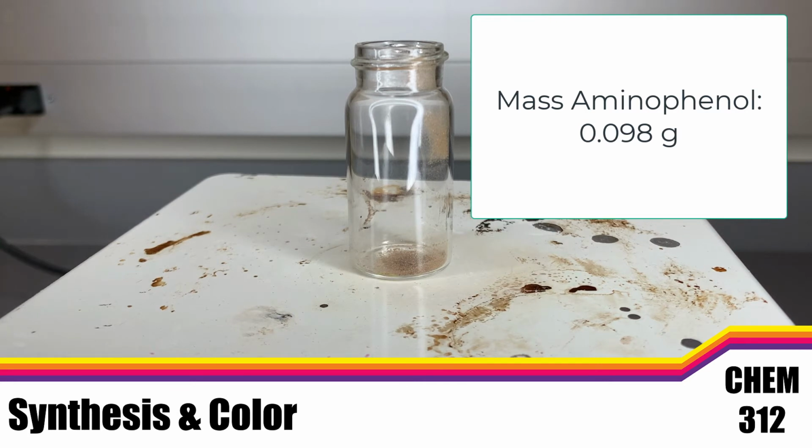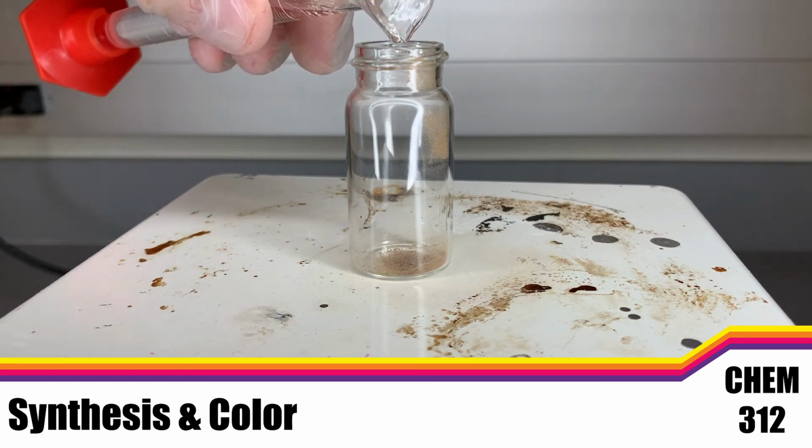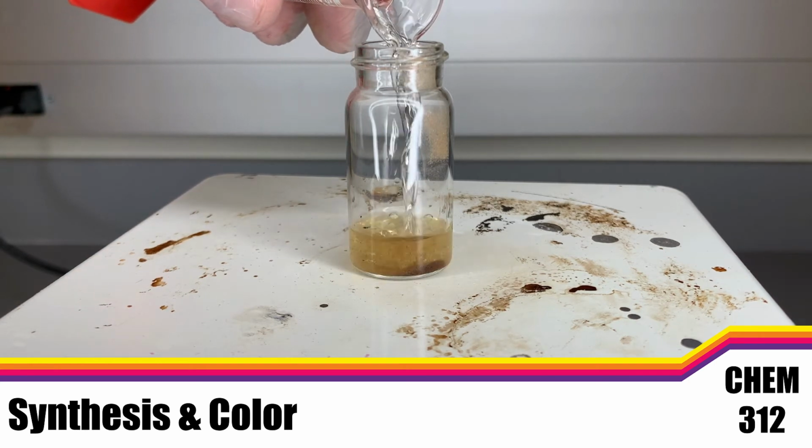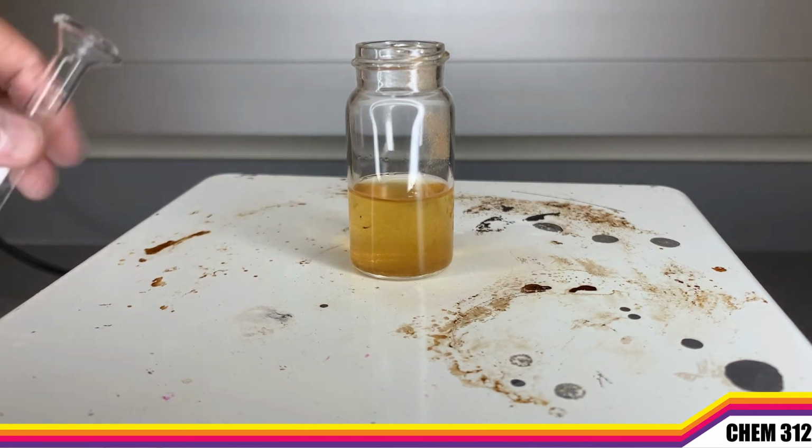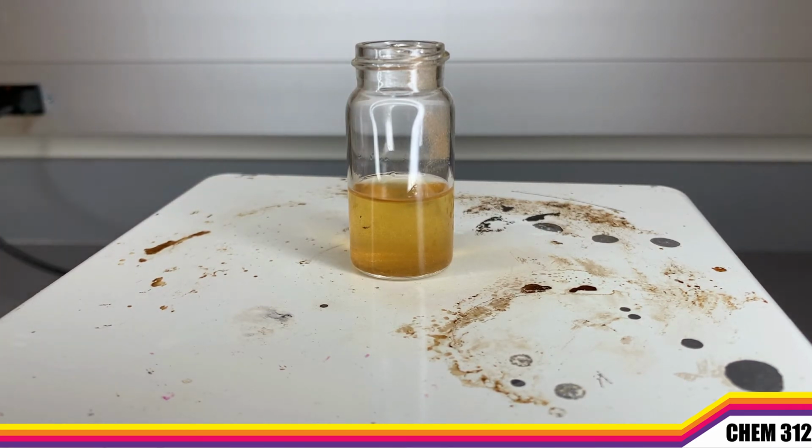The next thing I'm going to add is our solvent, which is 10 milliliters of ethanol. We can see here that the aminophenol is actually reasonably soluble in the ethanol. We have this nice brown solution that we might expect if we had a brown solid that dissolved. We can give this just a quick little stir to get things started.